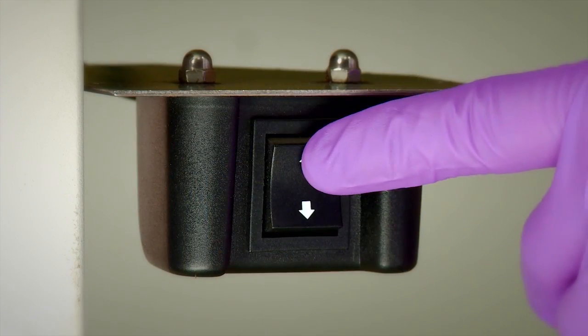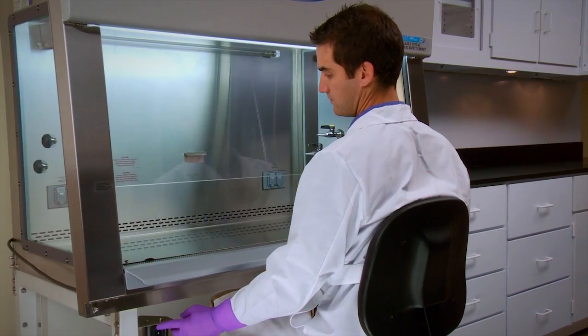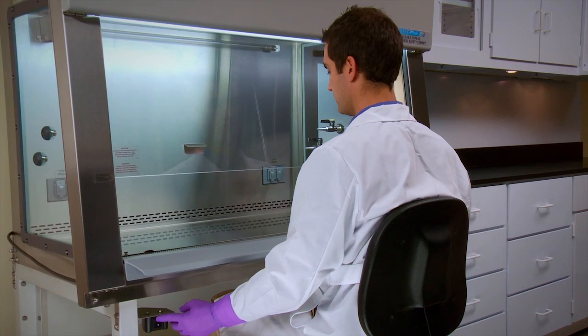A wide variety of base stands from fixed, telescoping to automatically adjustable provides the customization.